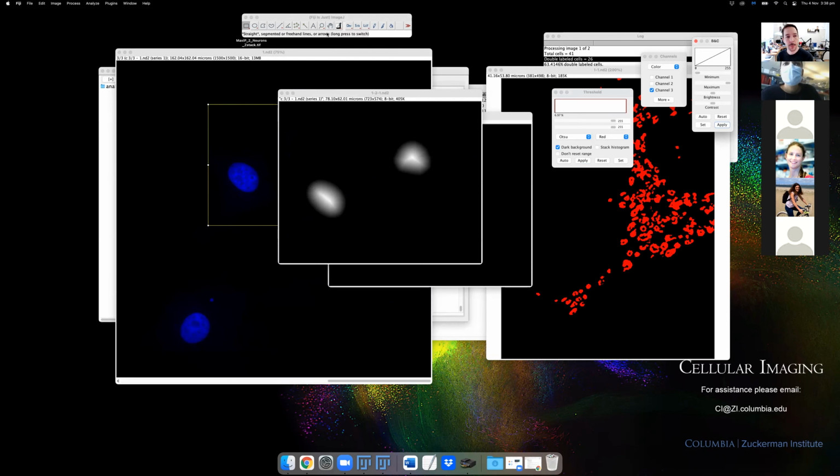The intensity now, you can see it's 0 out here. I'm just looking in the status bar. So it's 0 out here. As I come in, it's starting to get higher. So this is distance in pixels. So it's very useful to very quickly make measurements.